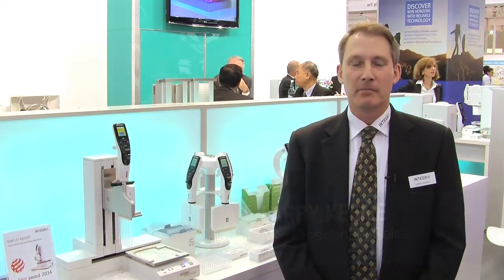Hello and welcome to Integra Biosciences booth at Analytica 2014. My name is Larry Keene and I'm the Vice President of Sales for Integra Biosciences. Today I want to take the opportunity to show you our air displacement liquid handling products with a focus specifically on ergonomics.